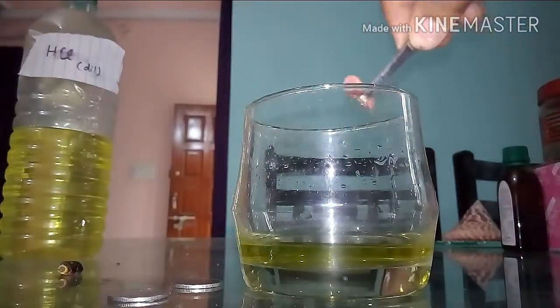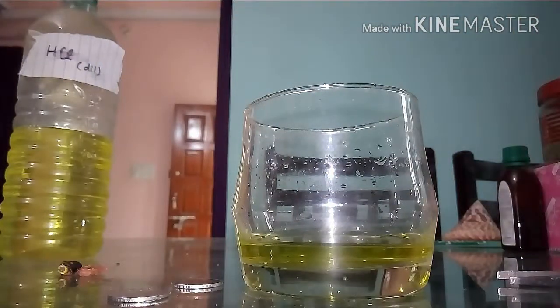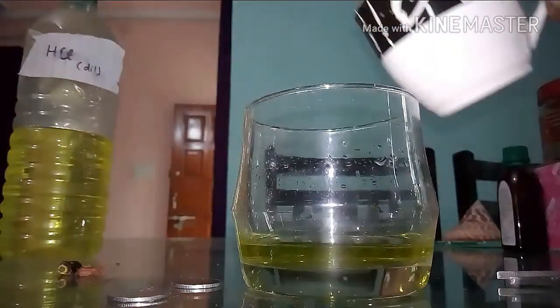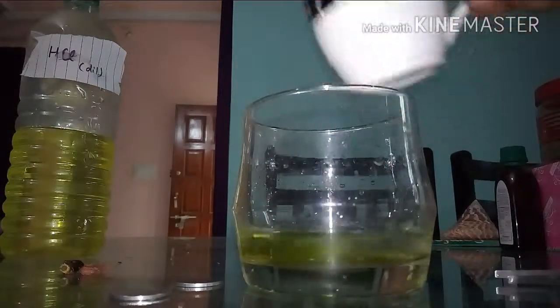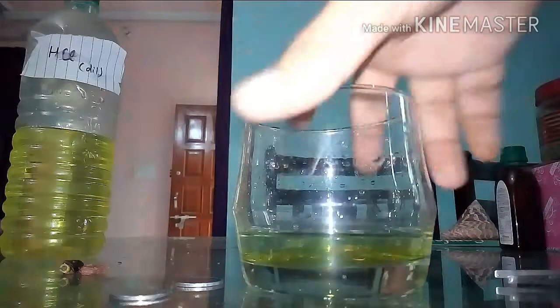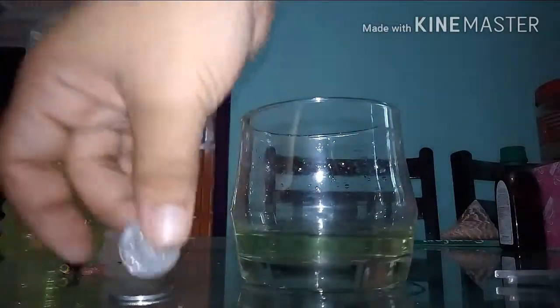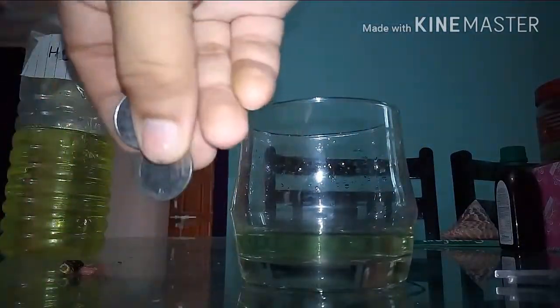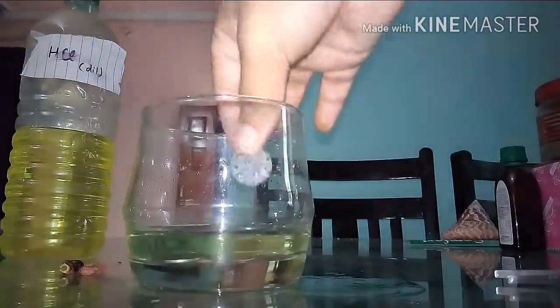After a couple of minutes, I'll go ahead and take our copper pieces out — there was the first one and there was the second one. Now it's time to dilute our solution. Add as much water as the amount of acid you added. This is a very important step because if you do not dilute it, the reaction will not take place and no copper will be deposited on your coins.